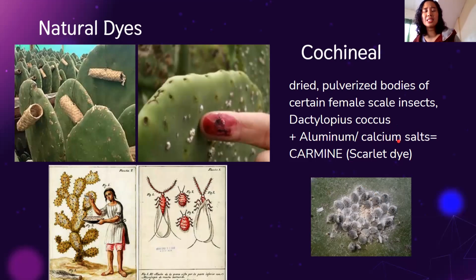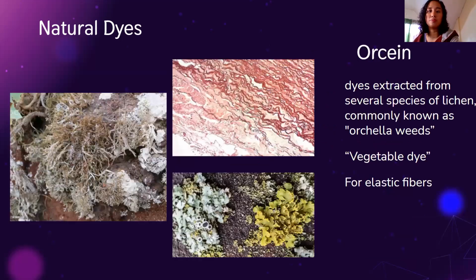Guys, ever since the beginning of time, ginagamit na nila to as dyes, itong mga bugs na to. Okay? So kung nakakita ka ng carmine stain, best carmine stain, galing yan sa cochineal dye or mga bug.